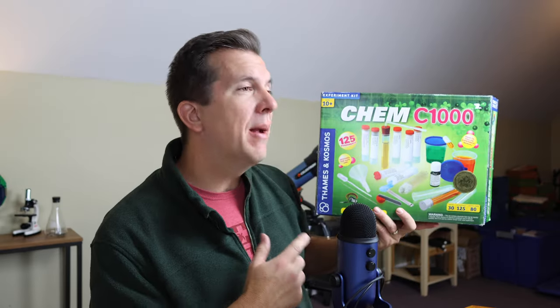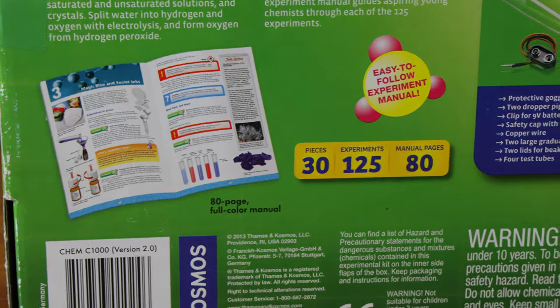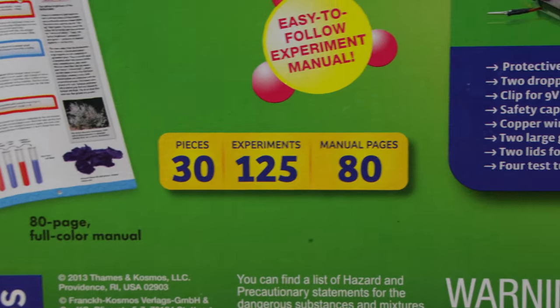Again, these negatives aren't specific to this chemistry kit — they apply to all the kits I've reviewed. My only real gripe specific to this kit is something Thames and Cosmos does with all their kits: they advertise 125 experiments, but some of them are quite redundant. In fact, the very first experiment is just teaching your kids how to filter sand water, and you don't really need a science kit to do that.